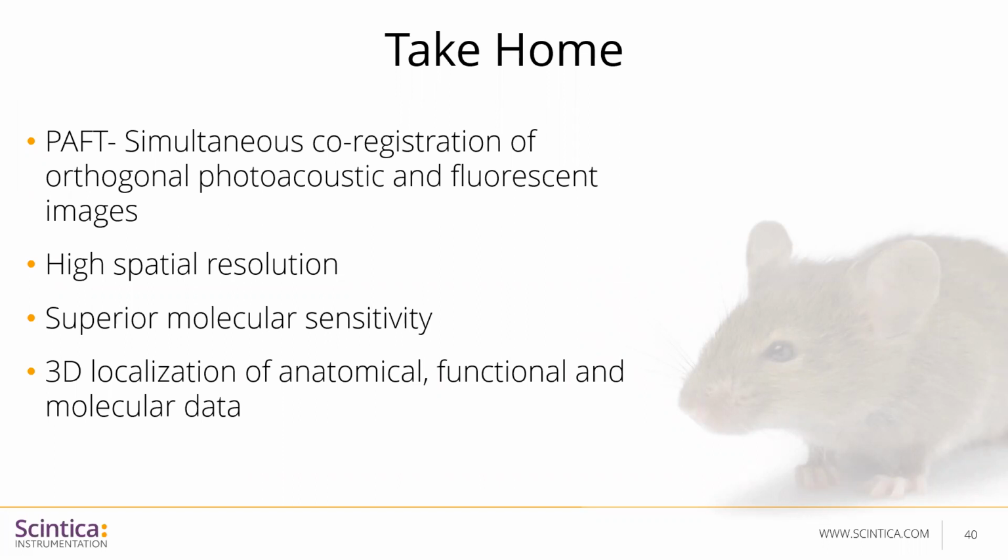One of the advantages of the PAFT technology is that it provides in vivo tracking, mapping, and longitudinal studies of externally labeled as well as internally expressed, that is exogenous as well as endogenous, light emitting or absorbing molecular constructs. So these are some of the advantages of the PAFT system.